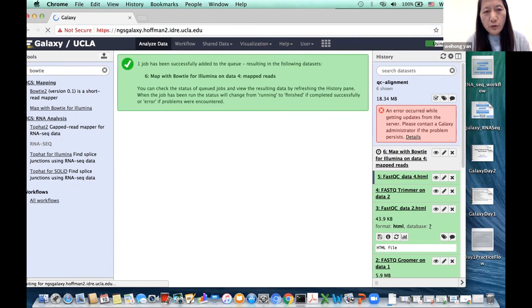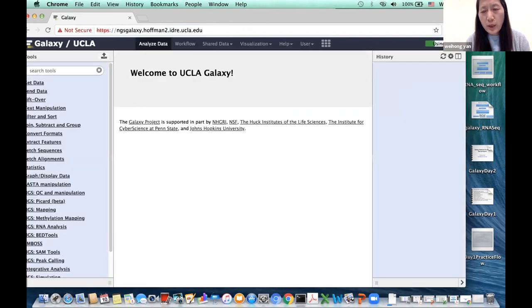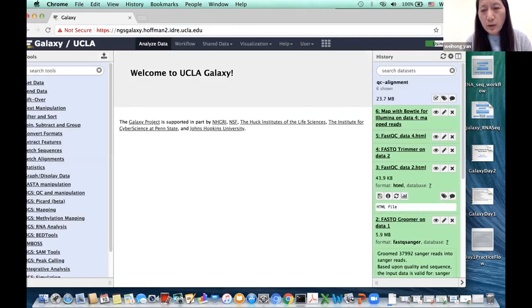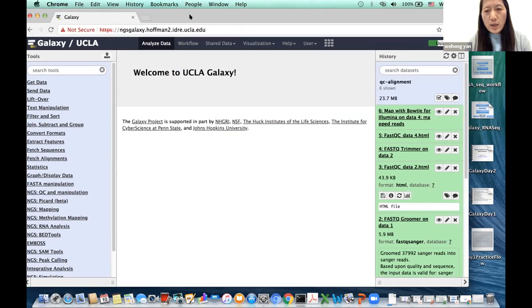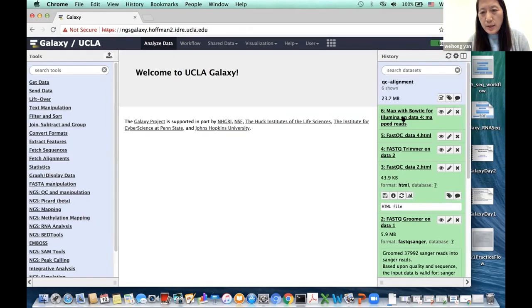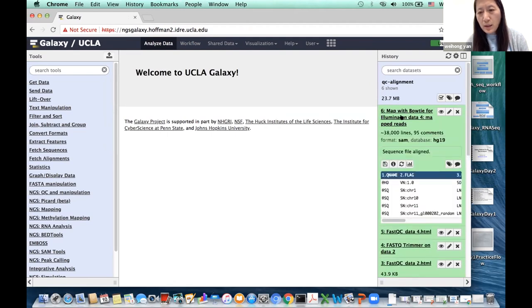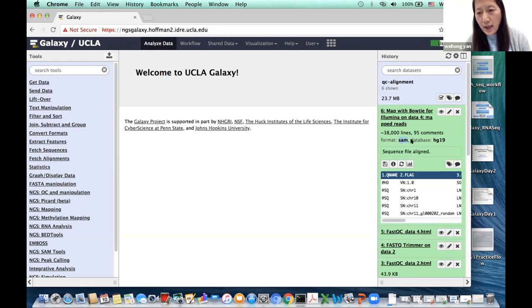When Galaxy starts it launches many programs and services, so it takes about 10 to 50 seconds to boot. Now I already have my Bowtie result back. The Bowtie output default format is SAM.